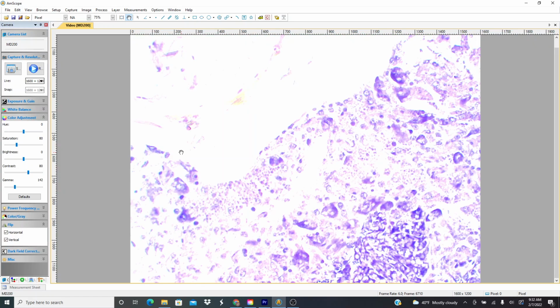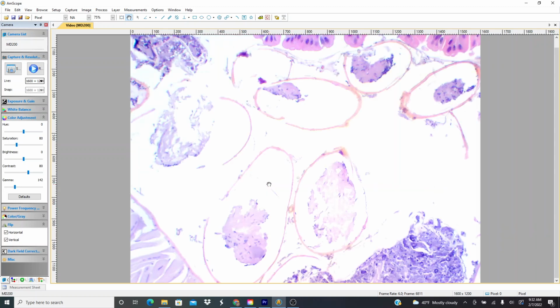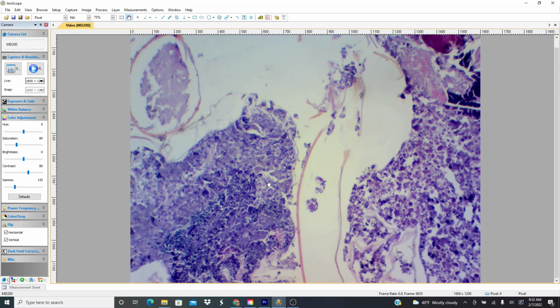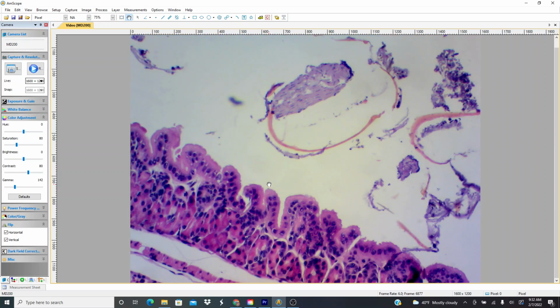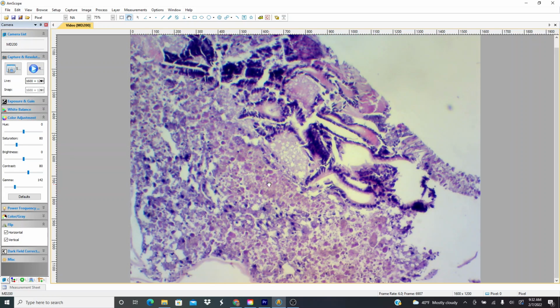But this material here reminds me of the chitin I was seeing in some of these other specimens, the exoskeleton of insects, so I wonder if this guy was eating insects or something like that. Most of this stuff just kind of looks like it's falling apart, being digested. Here's the lining of the stomach or gut or whatever you want to call it.